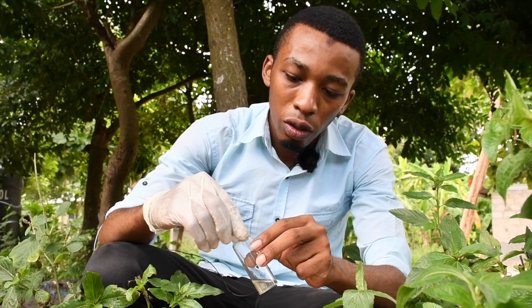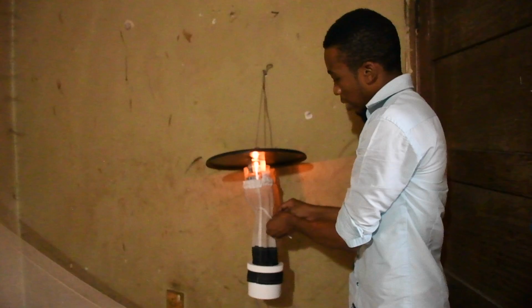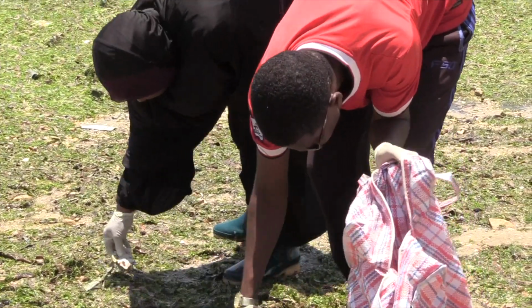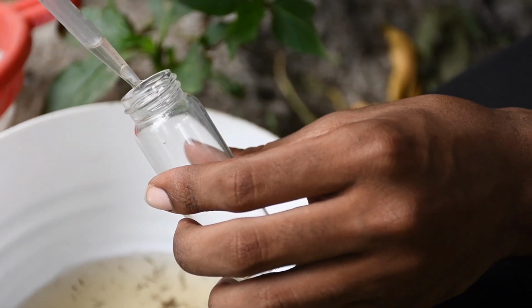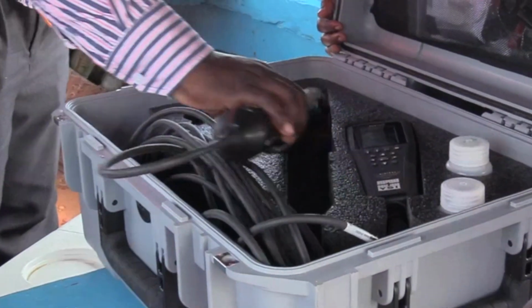In this video, you will learn how to perform primary data collection. That is, how you collect the relevant mosquito samples for your study. Systematic collection of primary data is a key part of field-based research. You should always use standard data collection methods. In this way, other researchers will be able to validate your research.